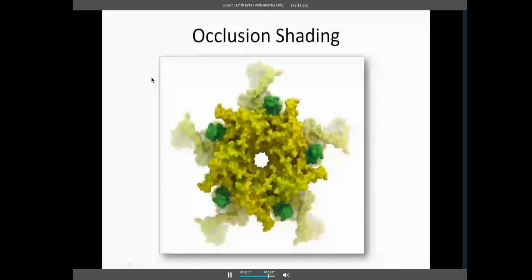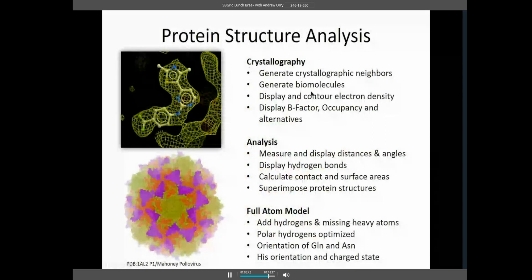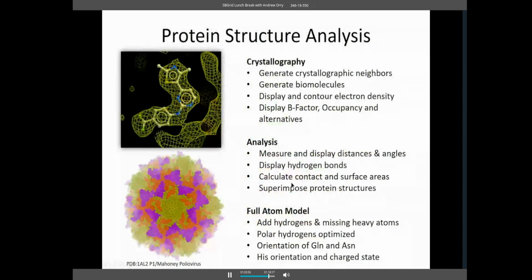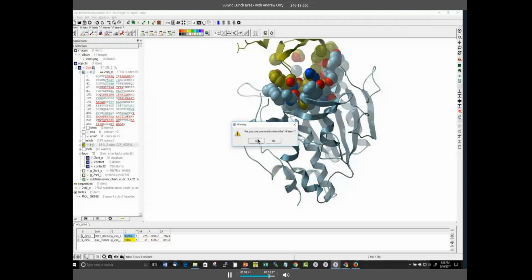Moving on to protein structure analysis: inside ICM Browser Pro there are crystallographic tools including generating neighbors, biomolecules, and displaying and contouring electron density. You can display B-factors and occupancy, measure distances, display hydrogen bonds, calculate contact and surface areas, and superimpose protein structures. For electrostatics you need to build a full-atom molecule by adding hydrogens, adding missing atoms, optimizing polar hydrogens, and checking ideal orientations of glutamines, asparagines, and histidines for hydrogen bonding network and charge state.